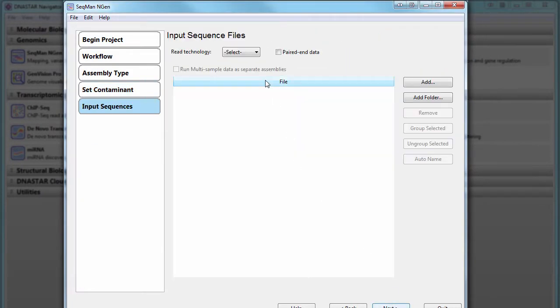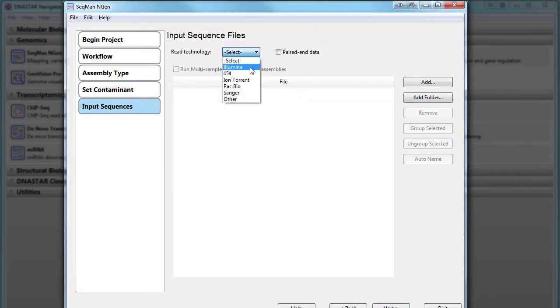Next, select your REIT technology and load your sequencing data.